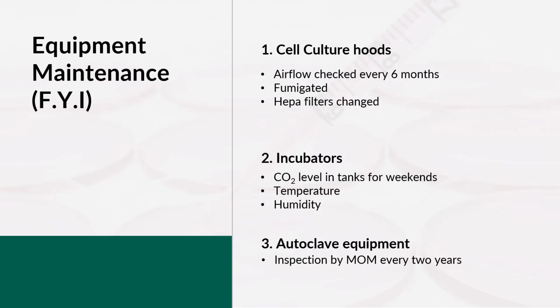At the same time, you can do general cleaning and decontamination of the incubator to remove any kind of dust, debris, or spills that could happen throughout the time when people are using the incubator. Okay, so you can do this cleaning and decontamination according to the standard protocols that are usually given by the manufacturer for the incubator.